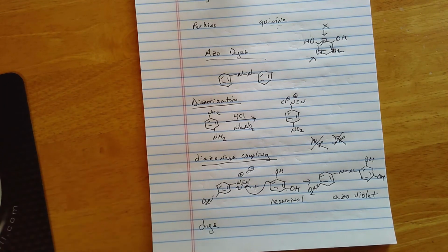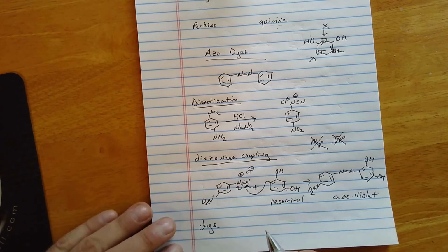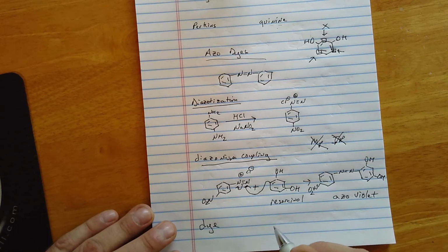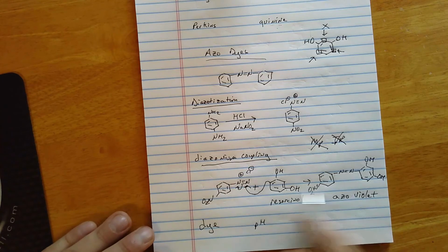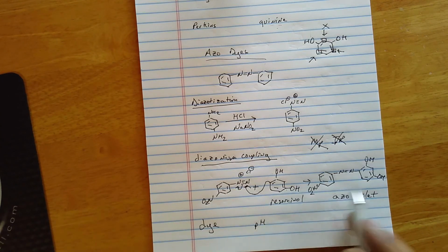The first thing that we're going to do is see, does our product behave like a dye? Azo violet is a dye, and it should dye cotton. And so that's one of the things that we're going to see. We're going to take a piece of cotton and see if it dyes it orange. And the other thing we're going to do is take a look at the pH.